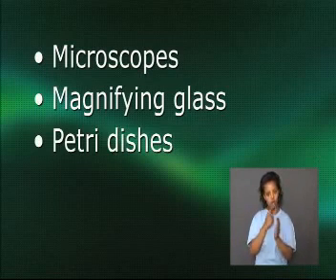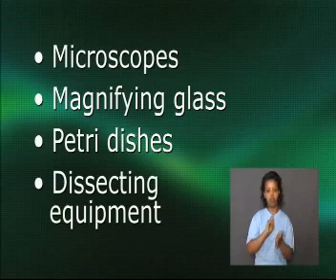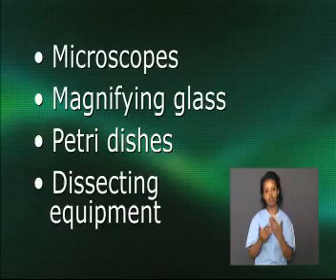You may have also said any item from the dissecting kit. All of the items function to remove the overlaying structures of a specimen to view specific structures closer. If you listed any other tools that I did not mention, please review your answers with teacher at the end of this lesson.